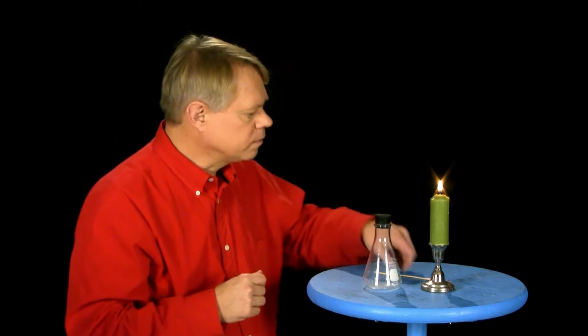This other part of the air is by far the larger proportion, and it's a very curious body when we come to examine it. It is remarkably curious, and yet you say perhaps that it's very uninteresting. It is uninteresting in some respects because of this, that it shows no brilliant effects of combustion. If I test it with a taper as I do oxygen and hydrogen, it does not burn like hydrogen, nor does it make the taper burn like oxygen.